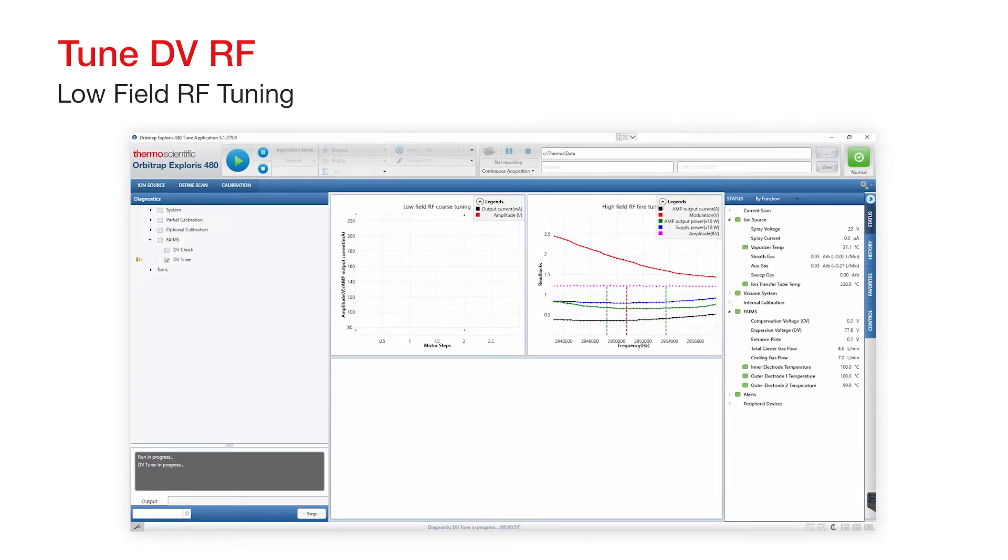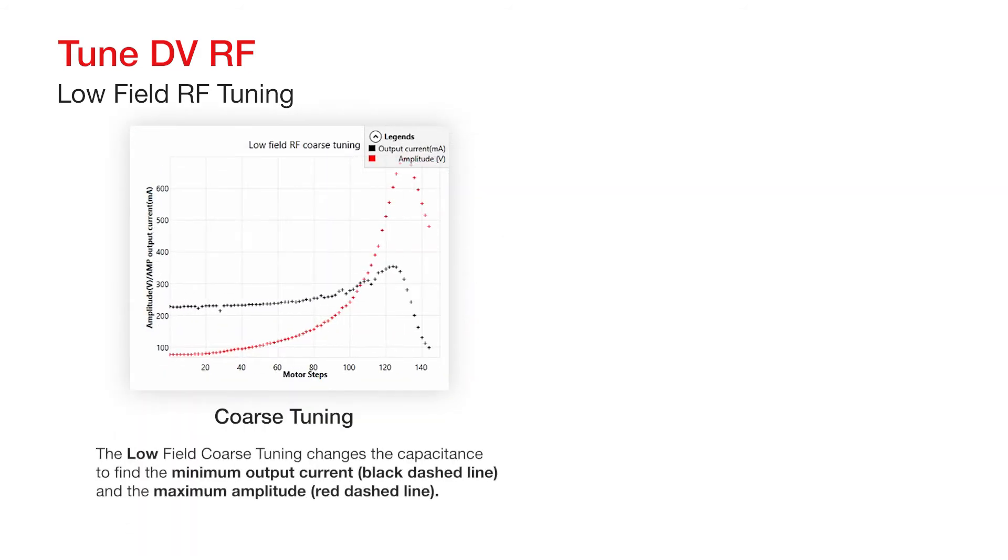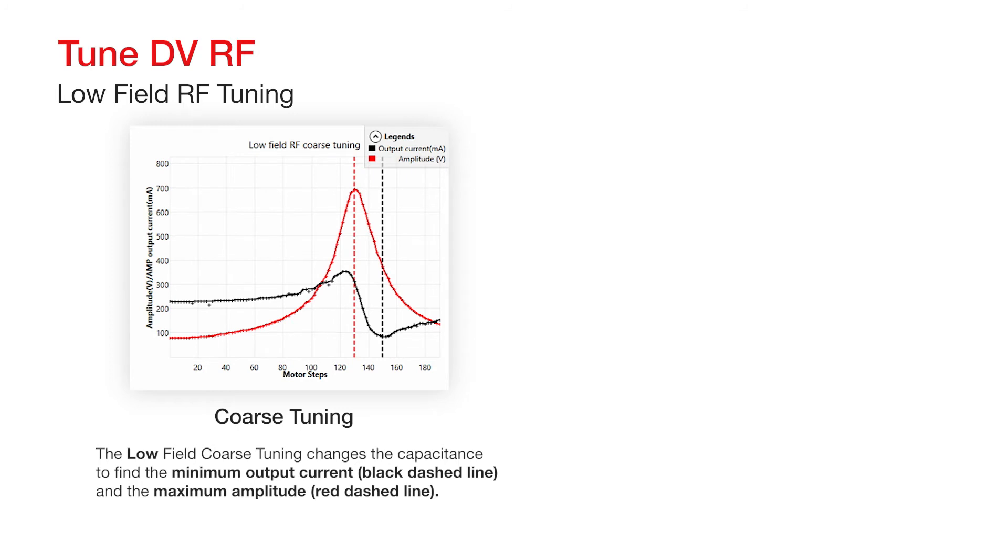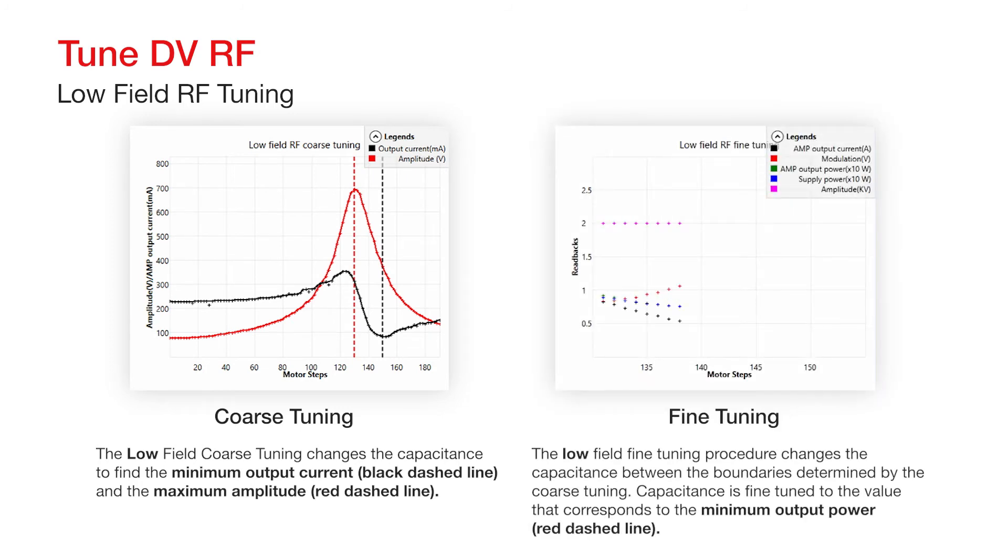Because of the nature of the asymmetric waveform FAIMS uses, the low-field frequency must be half of the high-field frequency. The high-field frequency varies for each system, so it's not possible to use a set value for the low-frequency transformer. The low-frequency is therefore adjusted by using a stepper motor to change the capacitance, which is used to bring the resonance of the low-frequency transformer to exactly half of the high-frequency for that particular system. The low-field coarse tuning changes the capacitance to find the minimum output current, shown here as the black dashed line, and the maximum amplitude, shown as the red dashed line. The low-field fine-tuning procedure changes the capacitance between the boundaries determined by the coarse tuning. Capacitance is fine-tuned to the value that corresponds to the minimum output power, shown as the red dashed line.